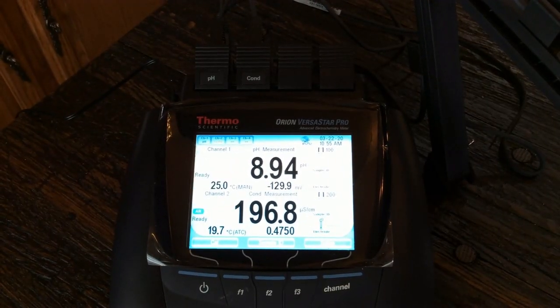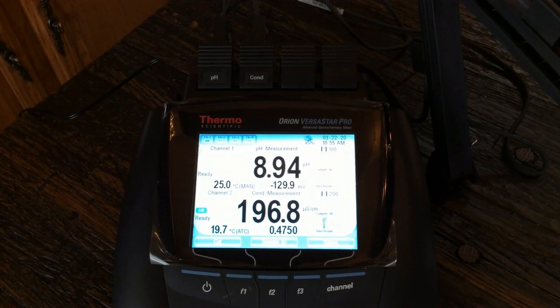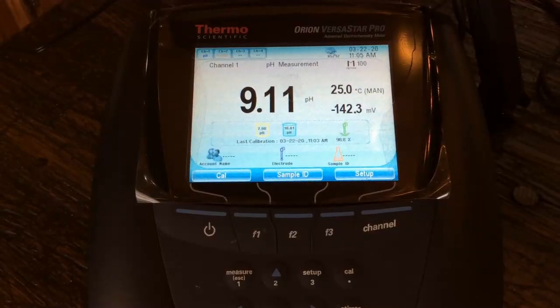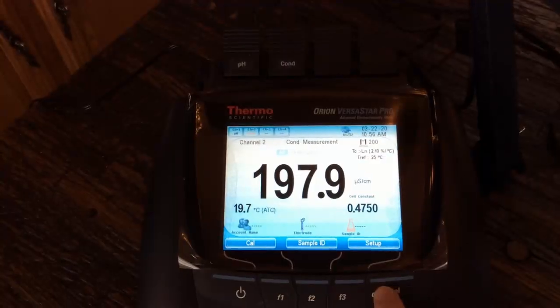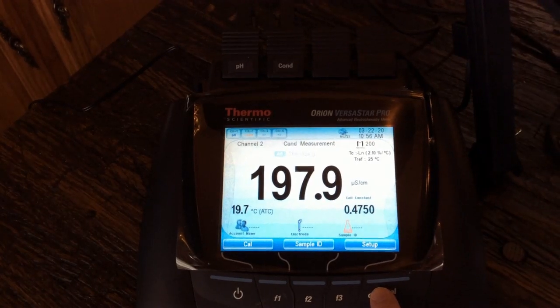One of the cool options on this — if you wanted to see multiple readings at once, like right now I'm seeing both my pH and my conductivity. But if I hit channel here, I can do one channel at a time. So if I wanted to see pH only, or conductivity only, it would only show that. However, if I'm doing a sample and I want to run both at the same time, I hit channel, I can see both my pH and conductivity, then I hit measure and I do one measurement to make two readings — makes things go quicker.